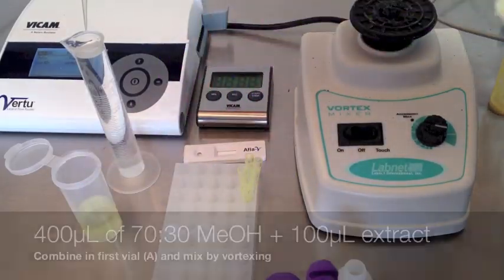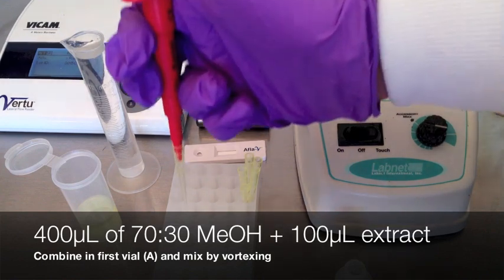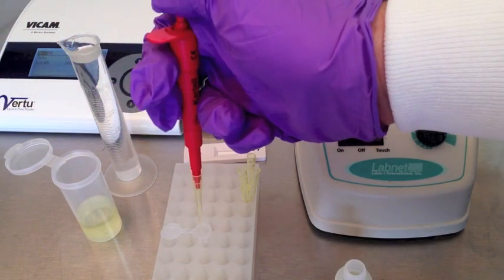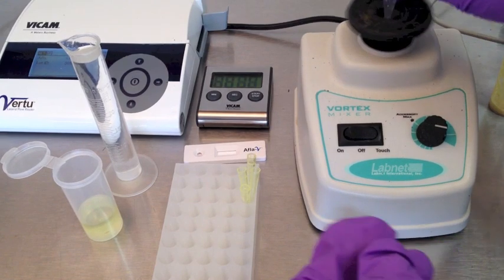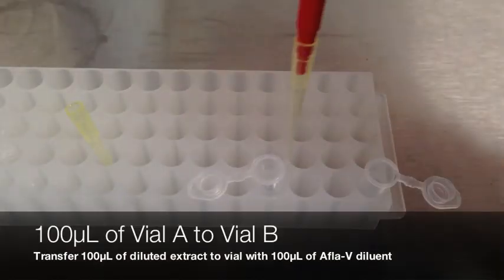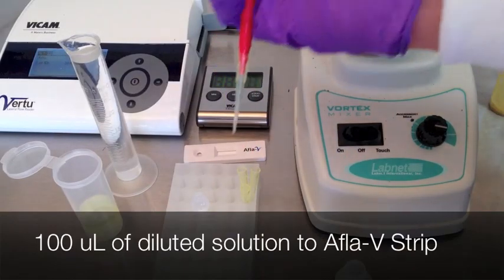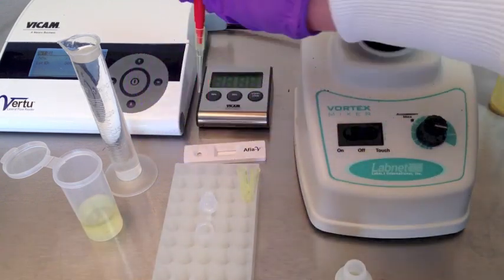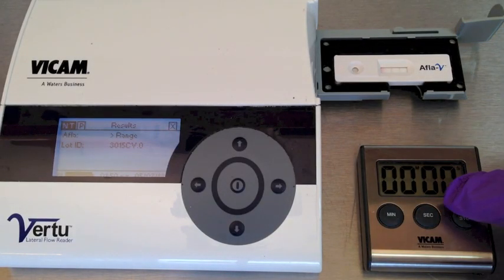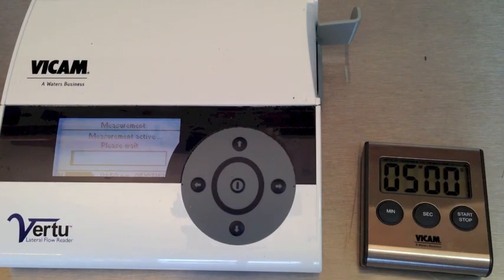Use the original filtered sample. Dilute the filtered sample in a new vial with 100 microliters of extract with 400 microliters of 70/30 methanol. Mix well by vortexing. In a second vial, add 100 microliters of AFLA-V diluent, then add 100 microliters of the first vial to the second vial and mix by vortexing. Pipet this new solution from the second vial onto a new strip. Let the strip incubate for 5 minutes on a flat surface. After 5 minutes, insert into the reader and read the results. Multiply the result by 5 for the true level of contamination, up to a limit of 200 parts per billion.